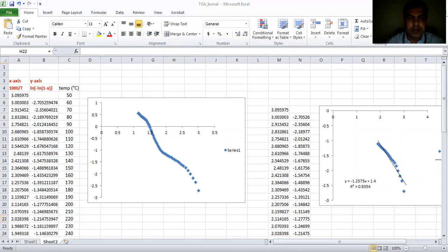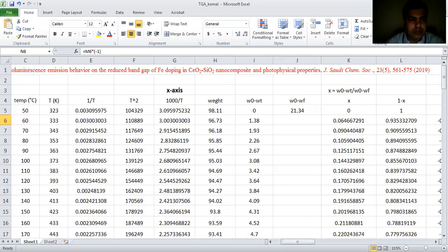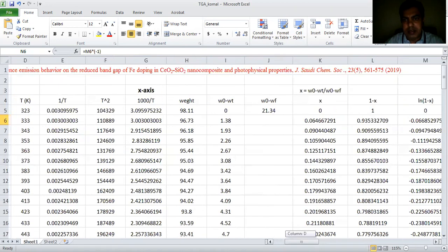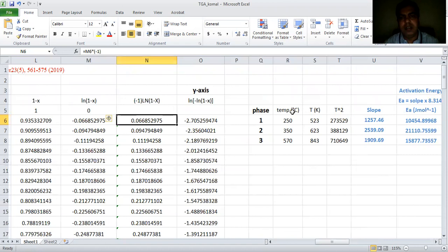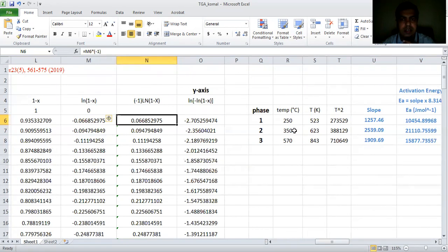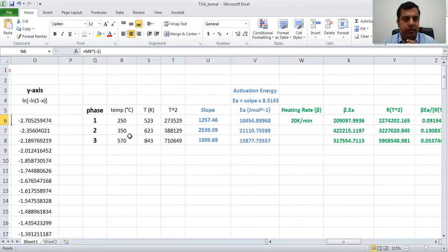Now moving on to how to calculate the thermodynamic parameters. We ended up to here — these are our three phases. The first phase ends at 250°C, starting from 50°C. The second phase is from 250°C to 350°C, and the third phase is from 350°C ending at 570°C. These three temperature ranges are used to calculate the thermodynamic parameters.